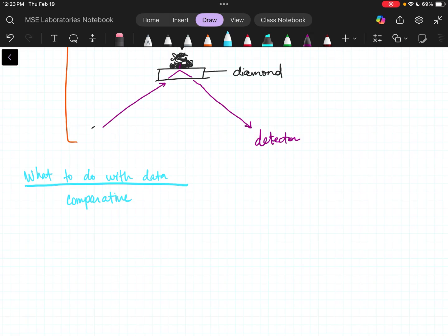That's gonna be everywhere, but you can identify individual peaks, and if that's helpful to you, you can compare one thing to another. So we can do comparative. We can compare one sample to another to just look at changes, like before and after heating, how does it change?